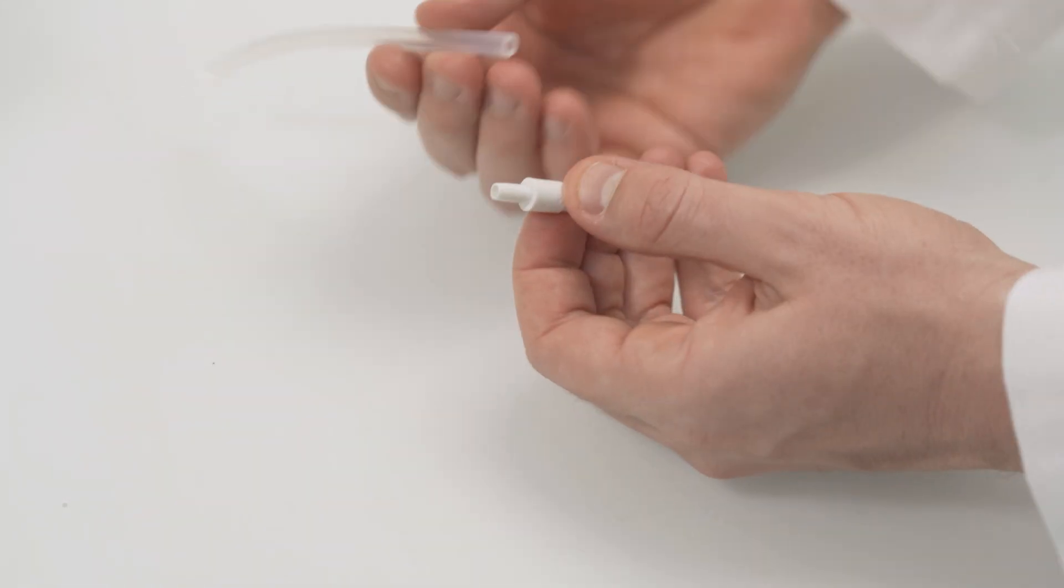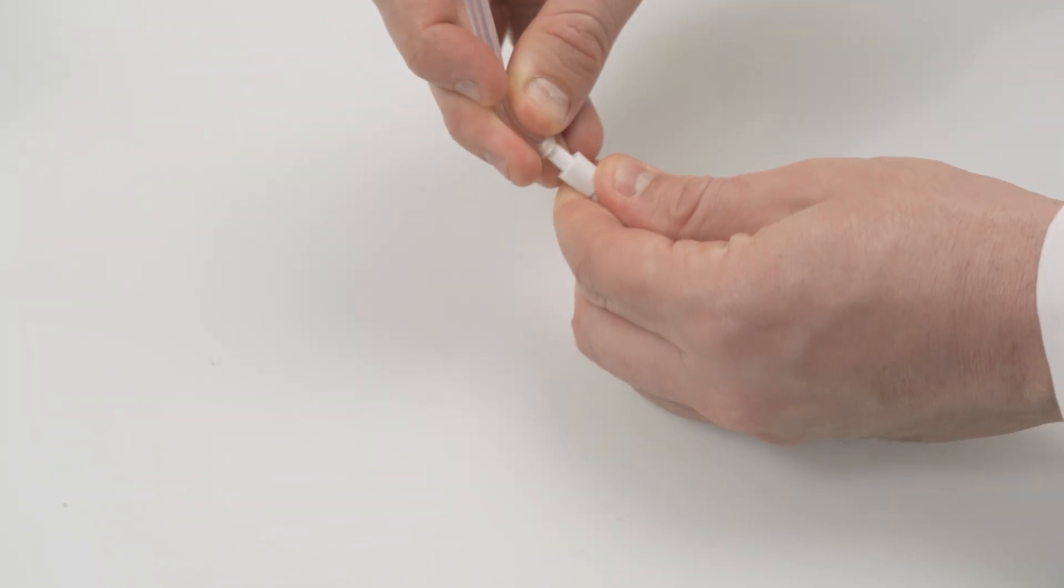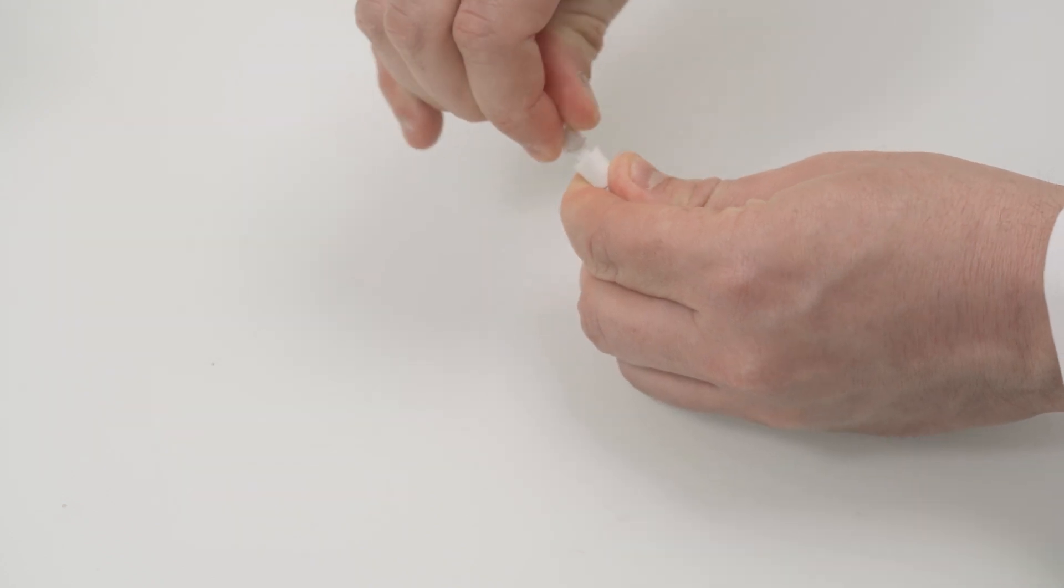Assemble the silicon tube connector and use it to connect the drying tube to the adapter plate of the KF cell.